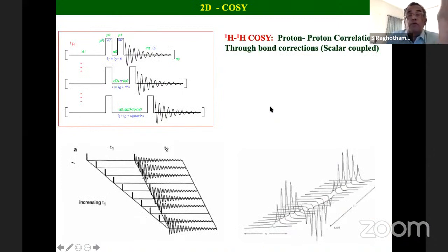Okay. Now coming back to the 2D spectrum, here is the slide which explains the basic 2D experiment called COSY. It's called correlated spectroscopy, first given by Professor Jeener in a workshop. Probably I told you that, and he forgot about that. He simply introduced it in a workshop. Luckily, it is documented somewhere. And then he didn't bother to take it up further. Then it's Professor Ernst, who, as I told you yesterday, waited for a certain time over years, then took his permission and went on to develop this technique. And it's so useful now. Everybody starts using it now.